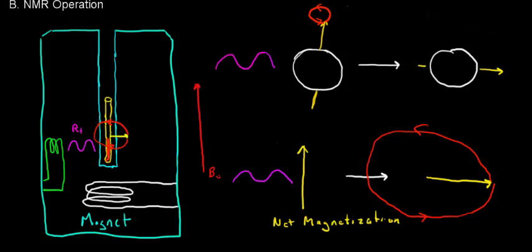And there's one more coil in the spectrometer. So here is the third coil in the spectrometer. This is known as the receiver coil. Like so. So that's my best effort at a coil. Now, a rotating magnetic field like this, this net rotating magnetization, will generate, and you learn this in physics, a current in a coil. This is how generators operate that make electricity. And so this rotating magnetic field creates a current in this receiver coil.